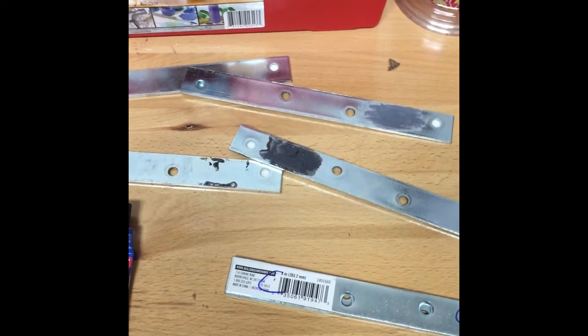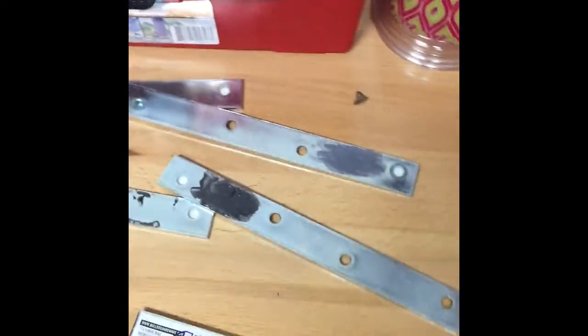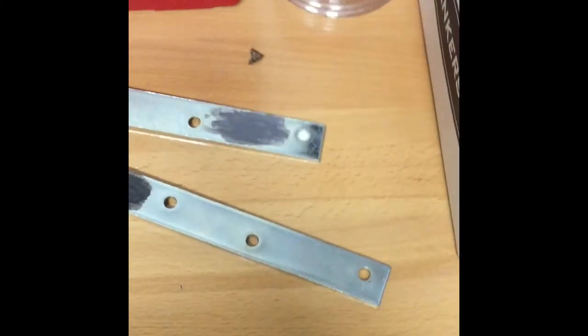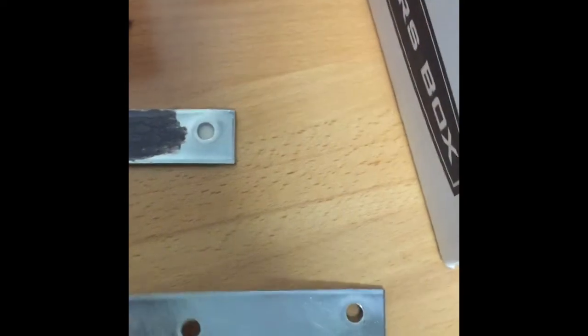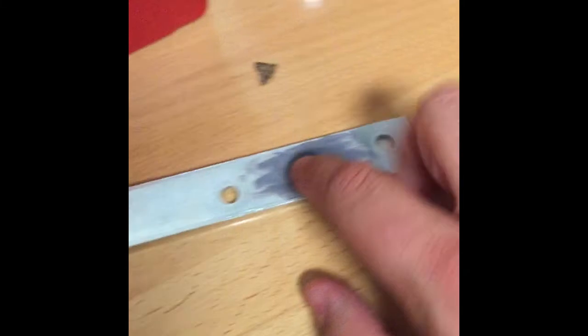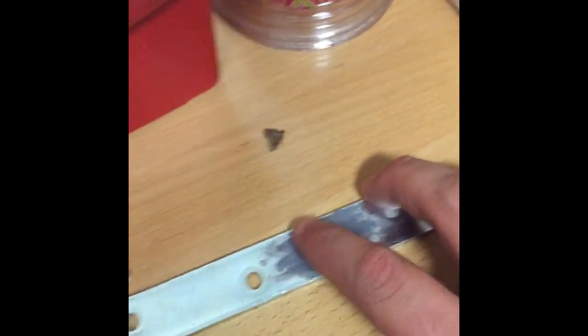Now I'm sitting here wondering what I could change to amend the experiment if we wanted to. Yeah, results are results. Sometimes things go wrong. This is science. The diamine becomes incredibly important in the cross-linking in the thermoset epoxy resin. Without it, the reacting resin is just not applicable enough. Notice here again, our B component that had more resin is still very wet. I don't want to touch it, but I'll get some paper there. Well, that's not really doing much, but it's sticking there to the paper, whereas this one, which had equal parts, is pretty much dry already and isn't going anywhere.